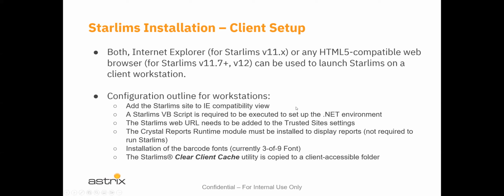So the configuration outline for workstations really boils down to these points here. You add a STARLIMS site to the Internet Explorer compatibility view. I don't have an instance of Internet Explorer running on my machine, so I couldn't show you that or even get screenshots of it. But there is a setting within Tools Preferences in Internet Explorer that allows you to set the compatibility view.